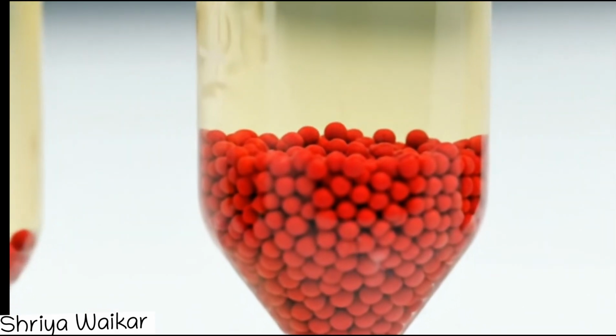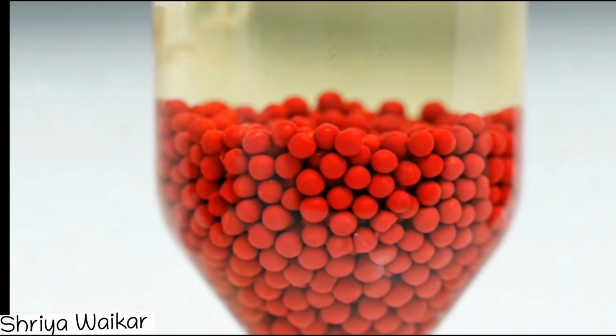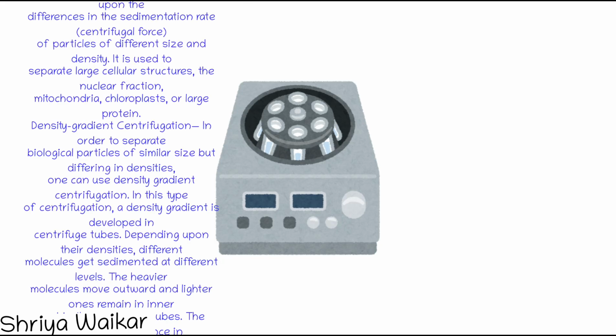What is centrifugation? You have studied various biomolecules like protein, nucleic acid, etc., present in the cell and all living organisms. To study these biomolecules, you need to isolate them by using one or another separation technique. I have made a short on the centrifuge. You can go and watch the video of the short on the centrifuge.